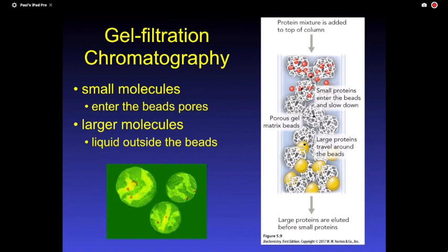This technique is as often used to desalt a protein as dialysis, because salts are very, very tiny, hundreds of molecular weight units, whereas the proteins are in the tens of thousands most of the time. And so running through a column like this can also be as effective to desalt as the dialysis that we saw.